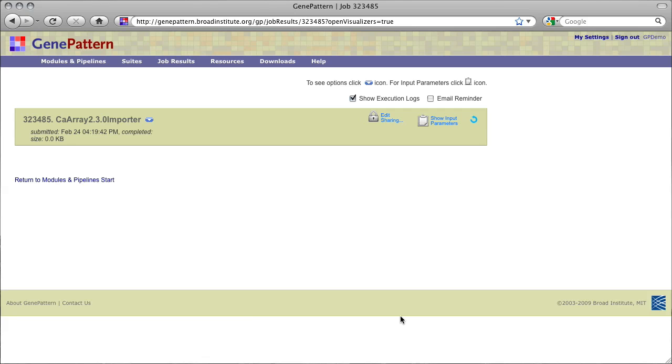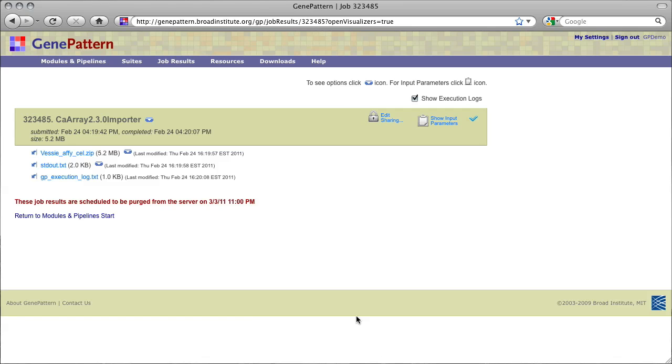Once the job is complete, we have an output .zip archive of cell files. Depending on the data type imported from the CA Array repository, there are some common next steps we may wish to take in order to analyze our data in GenePattern.